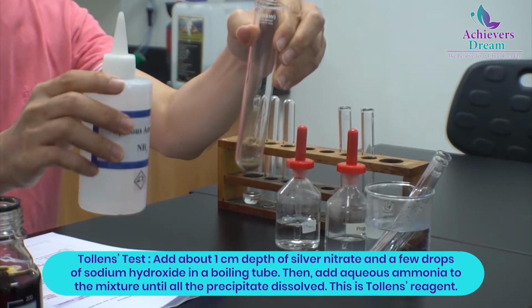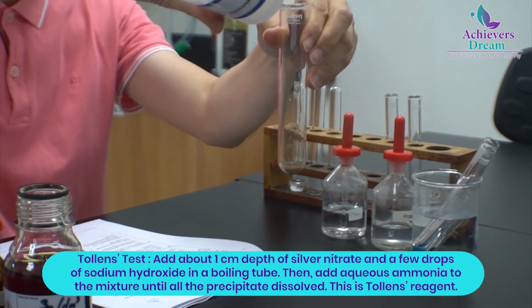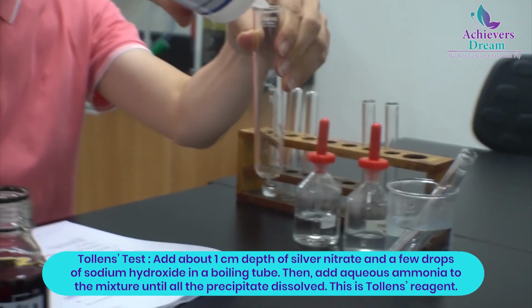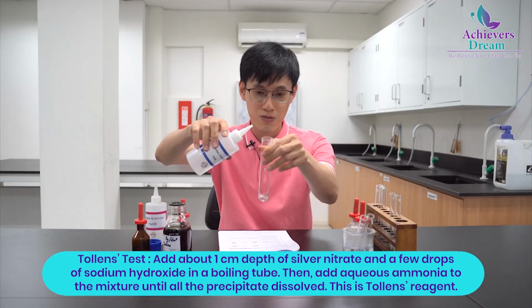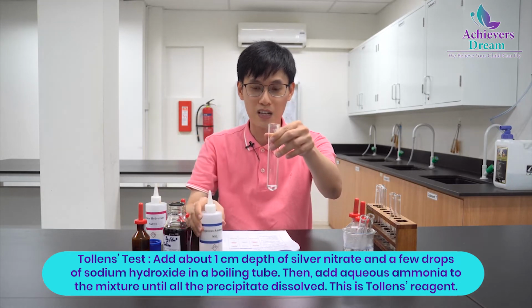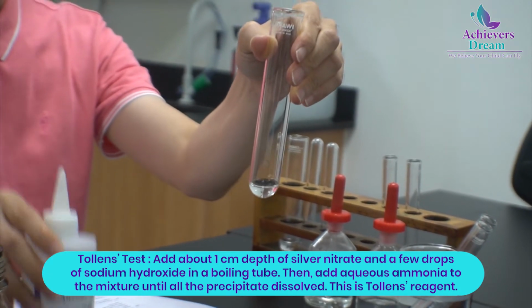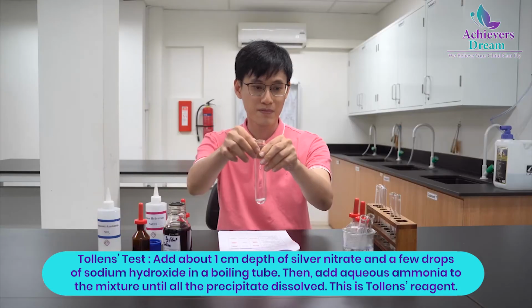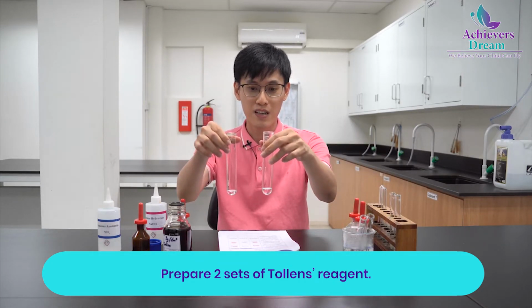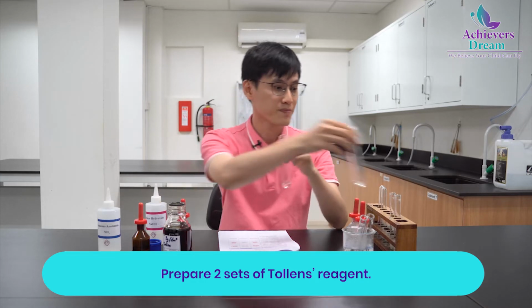We will be adding aqueous ammonia to dissolve the precipitate. Make sure when you add the ammonia in, all the precipitate is dissolved so that the solution is clear. Then you will know that ammonia is in excess and you have prepared Tollens' reagent. So I have prepared another identical Tollens' reagent in another boiling tube.